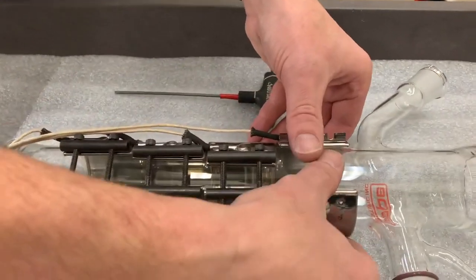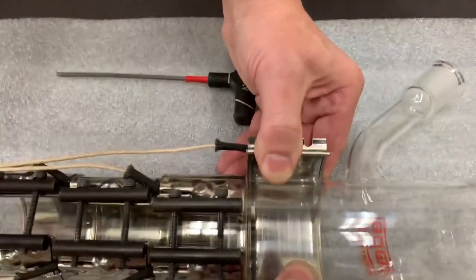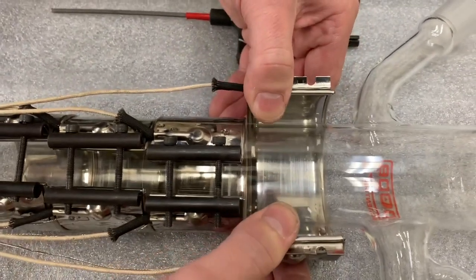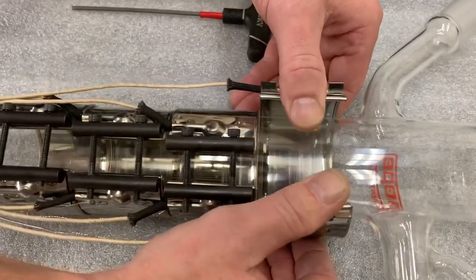Then we're going to very carefully expand out the band heater. You'll notice Dave is pulling it just wide enough so he can pull the glassware out, trying to be very gentle in doing so — again, so as not to crack any of the mica material that's inside the band heater.